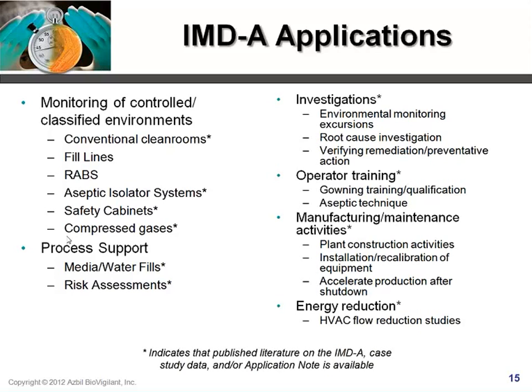So on the right-hand side of the slide, we have some applications that may be less obvious to someone thinking about a system such as the IMDA. One of those is investigations. Basically what we're talking about here is the ability to use the IMDA to quickly get to the root cause of an investigation.